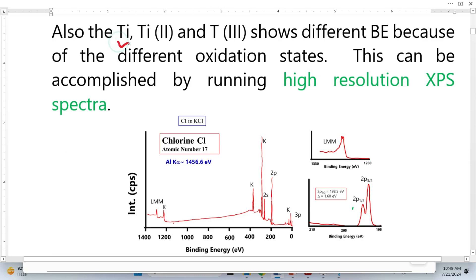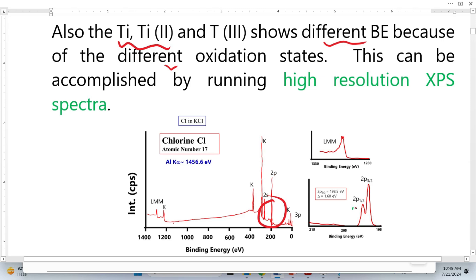Three different titanium species with different oxidation states show different binding energies, and these variations can only be revealed by high-resolution XPS spectra. If we just look at the peak in a survey spectra, we cannot see any variation in binding energy — it is very difficult. But in high-resolution XPS spectra, when we resolve these peaks, we can determine exact peak positions — for example, 198.5 electron volts — and the difference between two peaks, such as 1.6 electron volts.